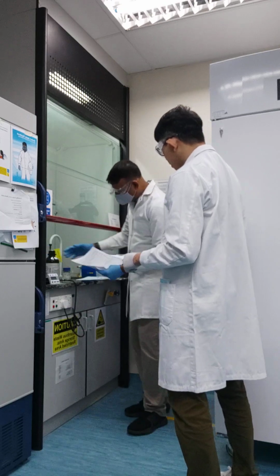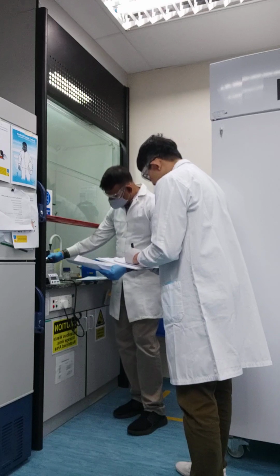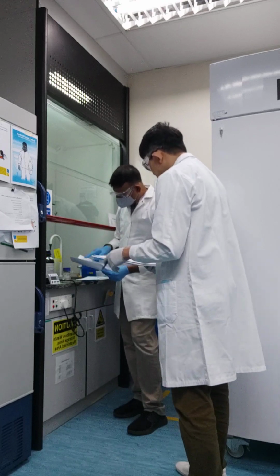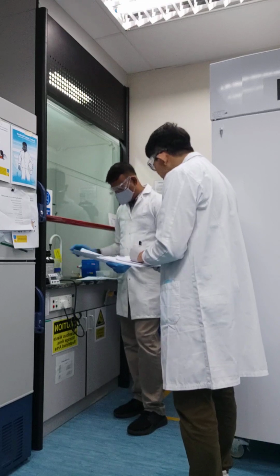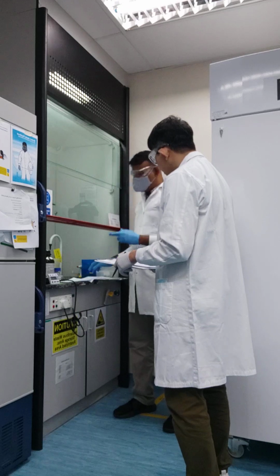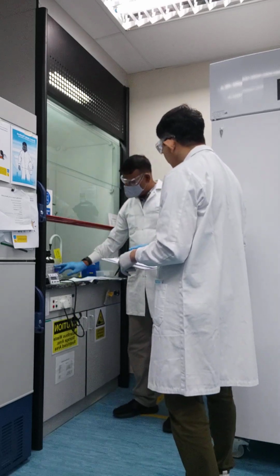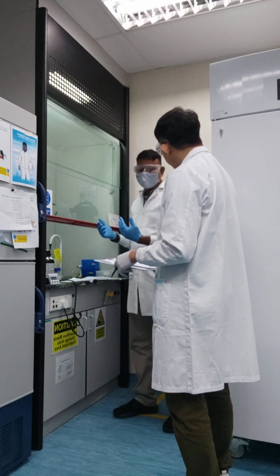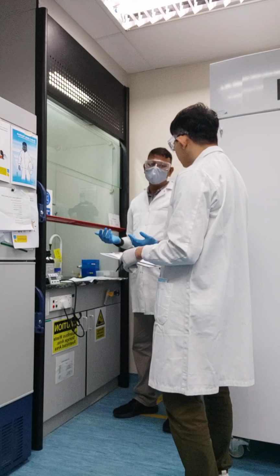So now I'm doing the verification according to the batch sheet. So we have checked that the batch sheet says that we need hydrochloric acid, 6 normal HCl. So we prepare according to the batch sheet. Step number 2. Step number 2 is to ensure that you have the relevant information about this material.